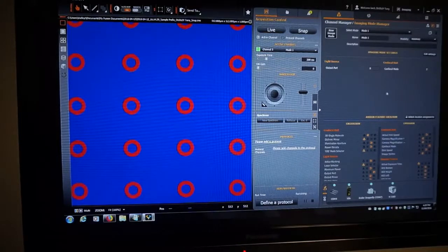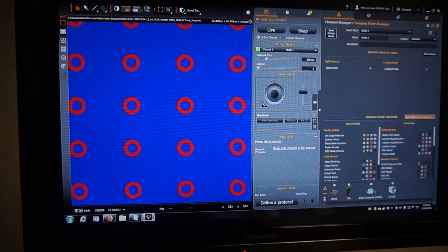Okay, and then down below is where, if you click unlock, this is where, again, left side excitation, right side emission. So you see confocal unit here, confocal unit here. These are excitation properties. And just like these symbols up here, the three circles say I want to make this parameter a channel feature.